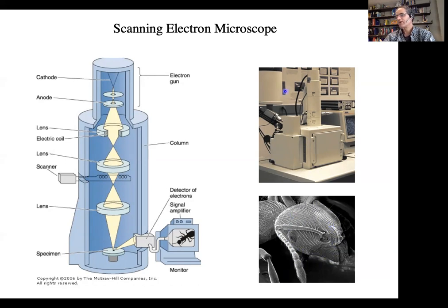The electron microscope itself is a relatively small instrument which can fit on a relatively small tabletop. This is the same model of microscope that we're using. In fact, most of the space is underneath this, and it's just the vacuum pumps necessary to pump all the air out of the electron microscope.